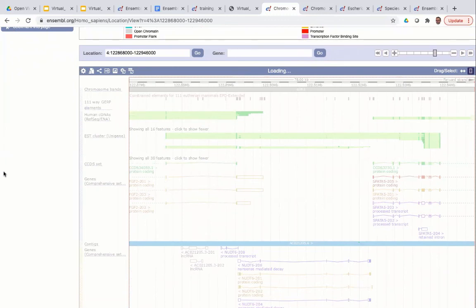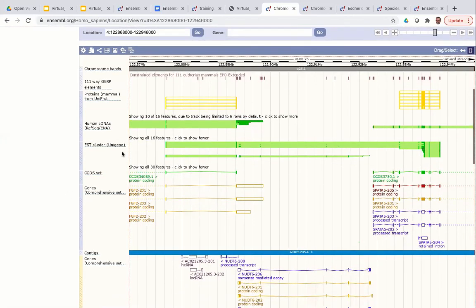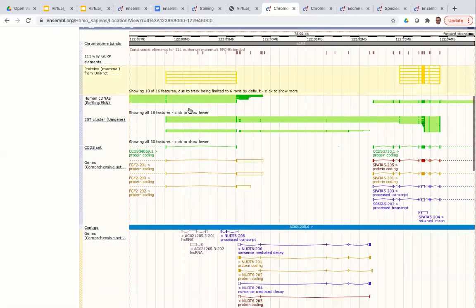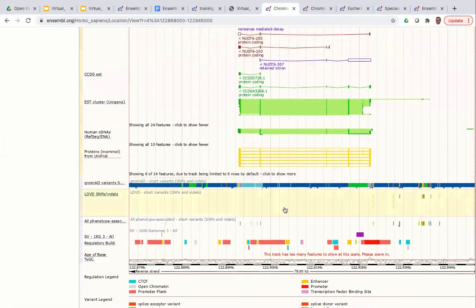Now you can see everything as before, but also the UniProt mammalian protein alignments on the forward strand — shown with the blue bar — and on the reverse strand as well. You can also see the LOVD variants track we added, showing variants from the LOVD database. You can get more information about and manipulate a track by clicking on the track name — this allows you to get more information, change the format, highlight it, or turn the track off.